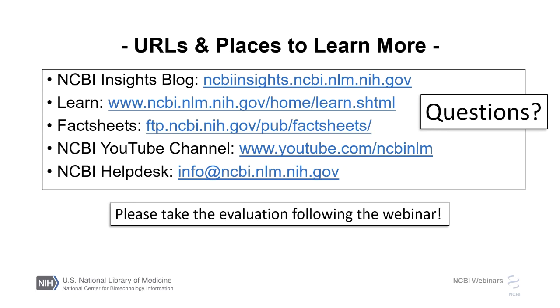Other barcoding sequences that one can use are RPB1 and RPB2, but I think elongation factor 1 is probably the best go-to protein coding gene after ITS. It depends on the clade or the genus you're working with. I suggest doing some homework, and if you're working on a specific genus, go and see what the literature says is the applicable gene to use in addition to ITS.